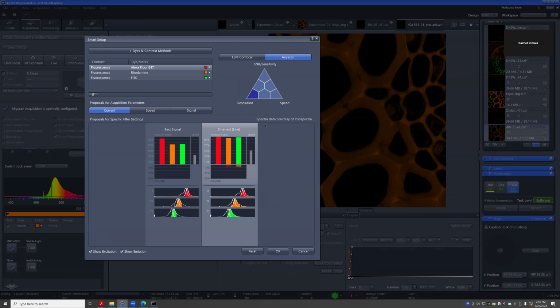Remember that experiment designer we looked at earlier? You could make it loop through, but that doesn't play nice with the direct processing if you have separate experimental blocks. You can tell it to project every time point as an individual file, and then open an individual file, even on the other computer, to process it and see what it looks like. But generally the direct processing just runs while the time lapse is running, so you don't have to run the full processing at the end. It spits it out pretty quickly after the time lapse is done.